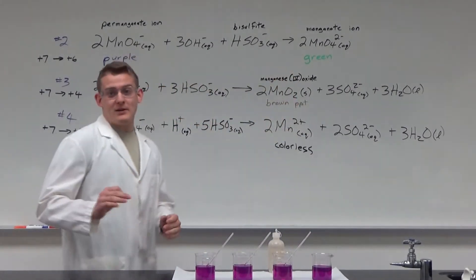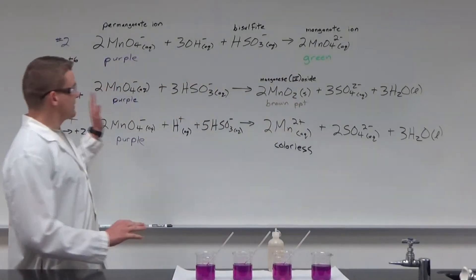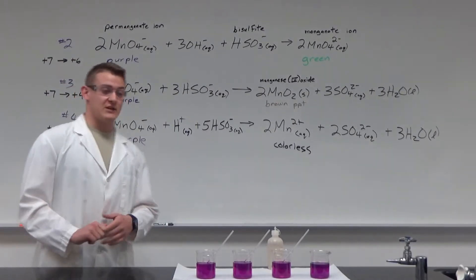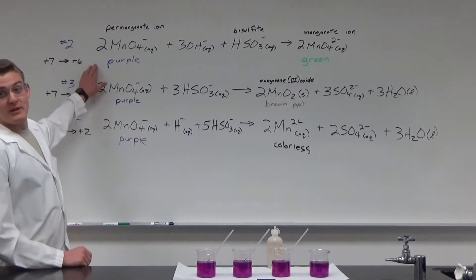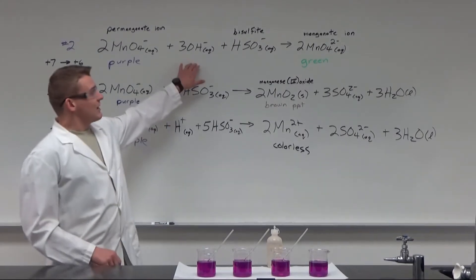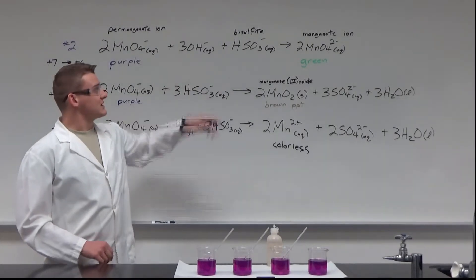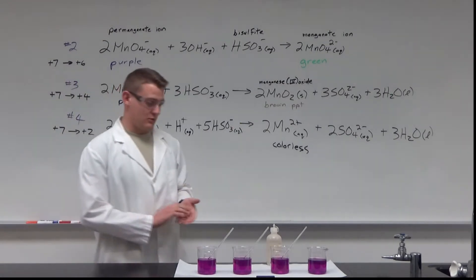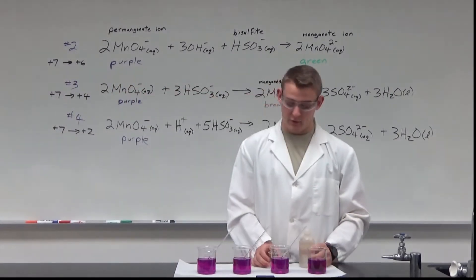As we manipulate the different oxidation states with the following reactions, we're going to see some color changes. The first reaction we're going to be doing is we're going to be putting some hydroxide solution and some bisulfite in the permanganate ion, and that should give us a green color. I'm going to go ahead and demonstrate that for you.